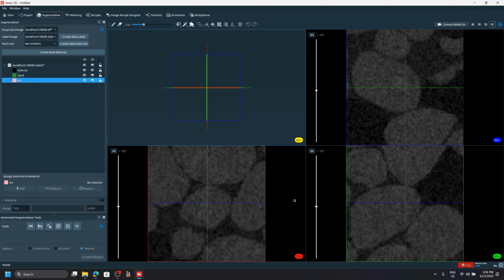And now if I want to say, okay, these selections or these highlights, add it to sand. So I click sand over here and then click add, all right? And once you do that, you're gonna see it changes color to green, which is the color assigned to the sand material. And for example, I want to add some materials to air. I'm gonna do this. So this is obviously the manual process, right? And you don't wanna do this. I'm just showing you the process. So I click air and then click add material, okay? And yeah, basically we've done our first segmentation, right? Using the segmentation workroom.